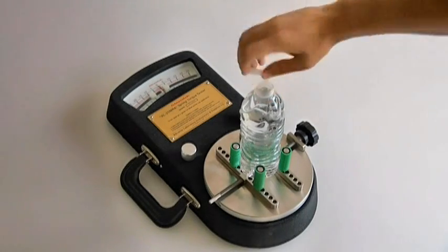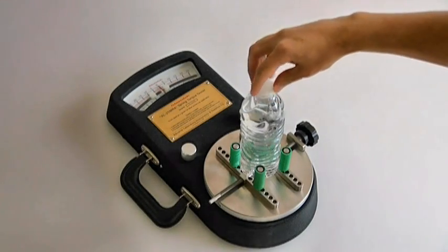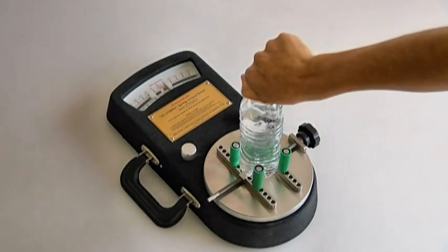The torque required to either open or close the container closure is then measured, and the markers record the highest torque reading.